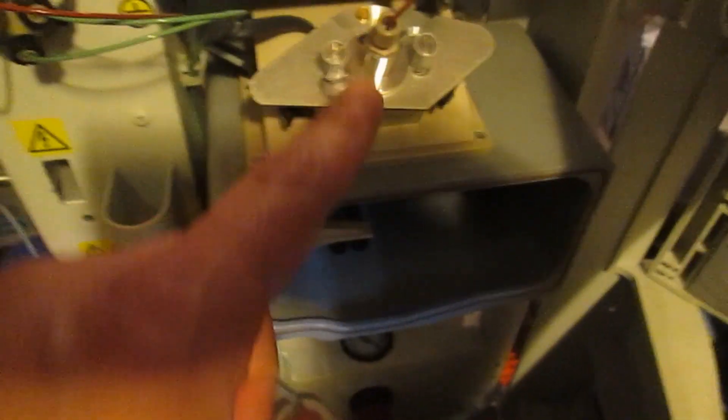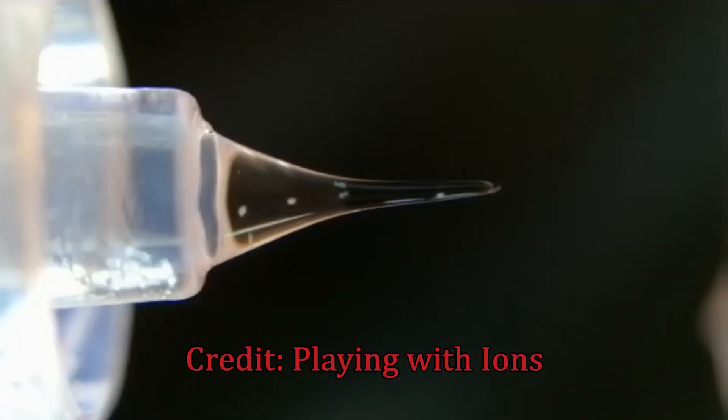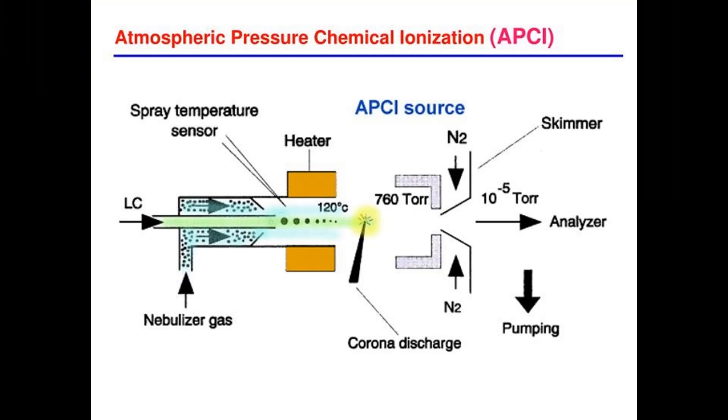The sample comes through this port and travels to the injection area of the instrument where it is ionized in two ways. Electrospray is preferred for polar compounds like water and those easily broken down chemicals. APCI works best with low polarity chemicals like hexane, for example.